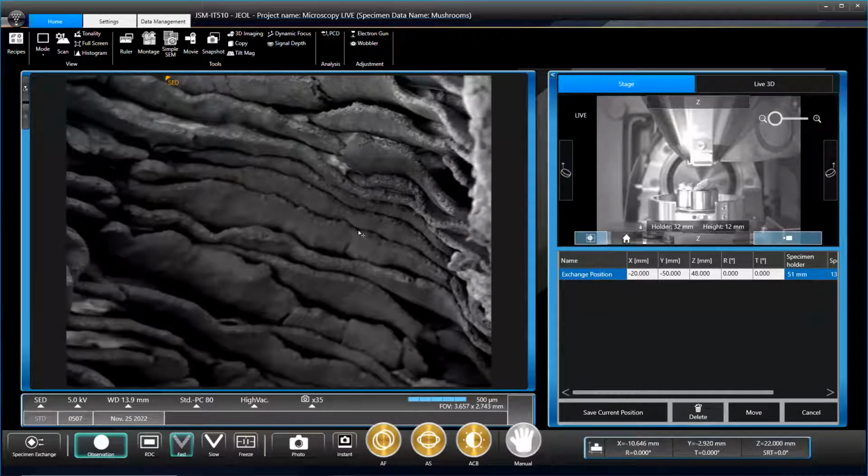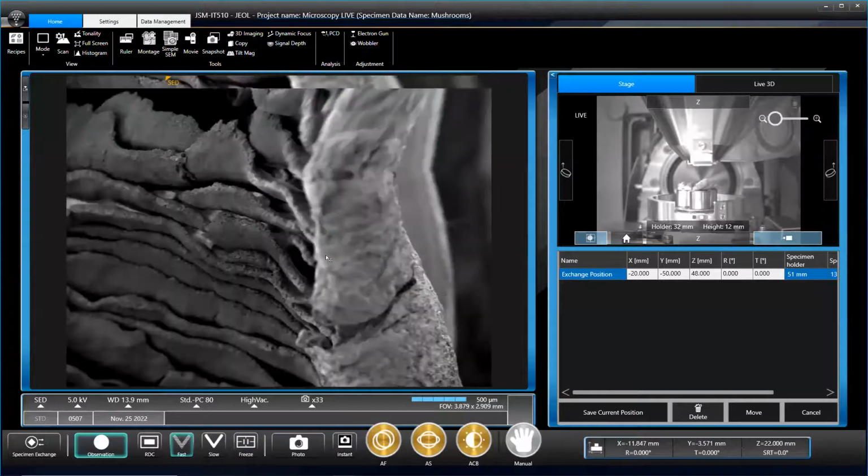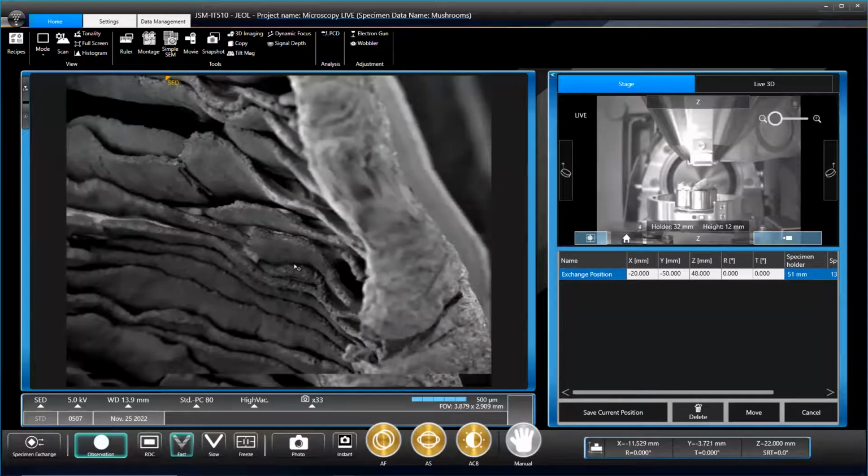So magic mushroom spores are a really nice velvety purple, like a deep purple. But you get various different colours. You get dark black ones, or you get white ones. Oyster mushrooms produce a really light coloured cream one. You can do this yourself as well. You just cut the cap off, put it on paper overnight with a moist dish over the top, and look at it in the morning, and you have a really pretty spore print. That's really cool. I didn't know you could do that. A little graphic picture for us. It's nice to see the variation in colour as well.